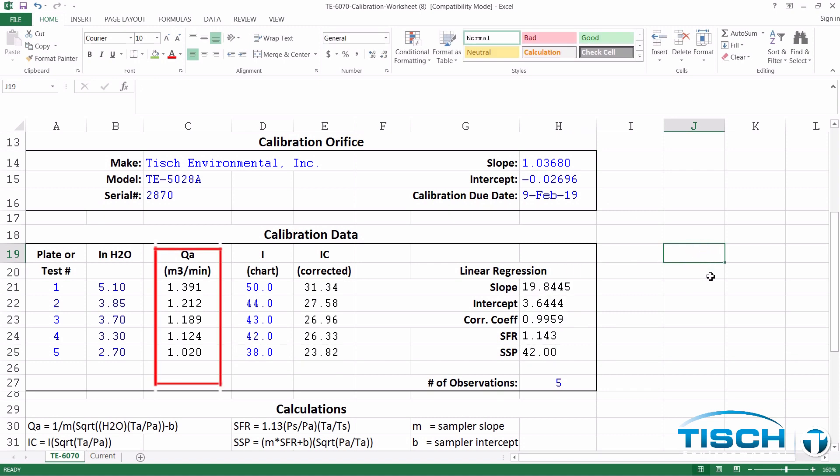In the QA column, you need a number higher than 1.24 cubic meters per minute and a number lower than 1.02 cubic meters per minute, with three numbers in between. Our correlation coefficient is greater than 0.990, which means it was a good calibration.